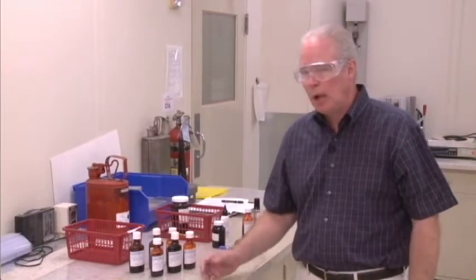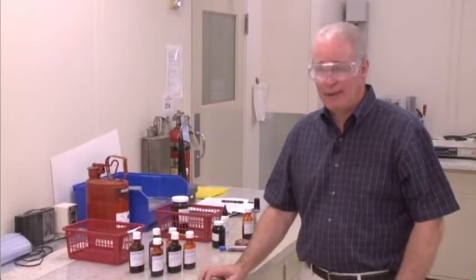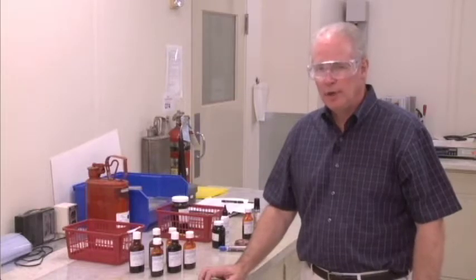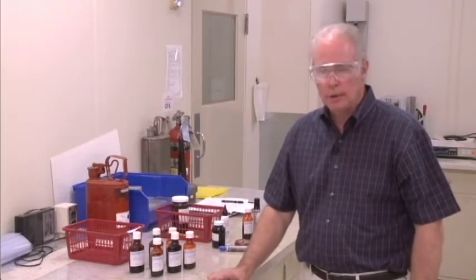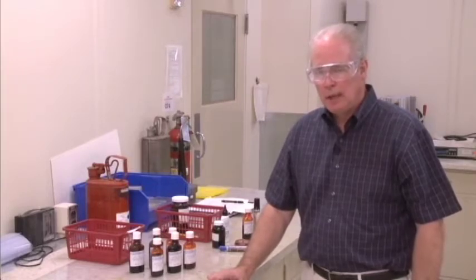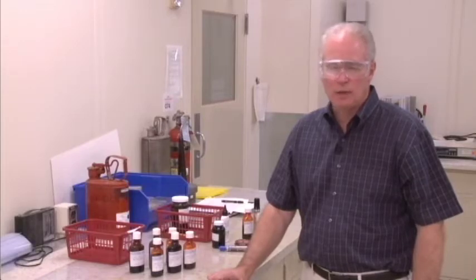The way that test works is the reagents are applied to the surface of the flooring. They're covered with a watch glass so the reagents can't evaporate. They're left on there for one hour, after which the sample is then cleaned off and evaluated very closely for any surface dulling, any discoloration of the surface, or any other form of attack like swelling or softening of the wear layer.